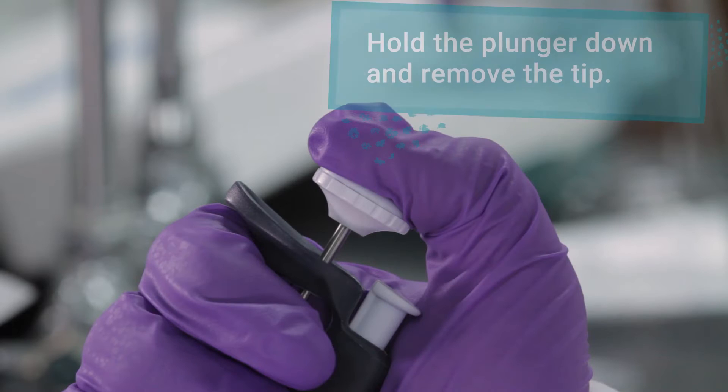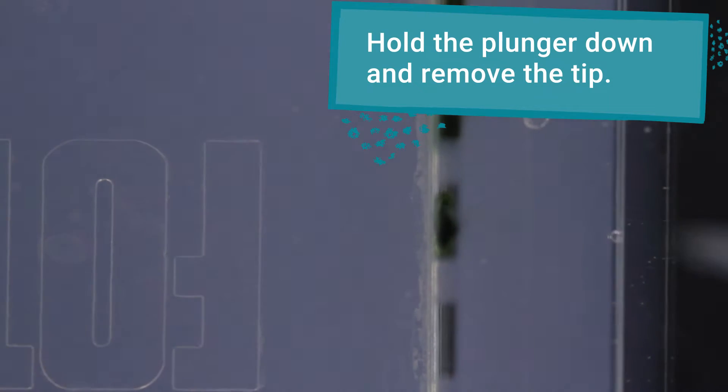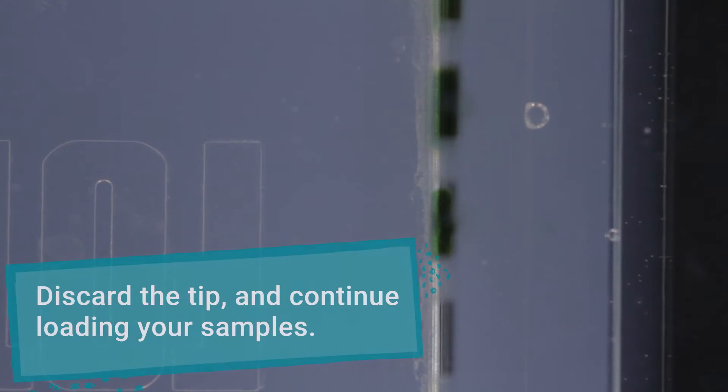With the plunger still depressed, remove the pipette tip from the well. Discard the tip and continue loading the rest of your samples.